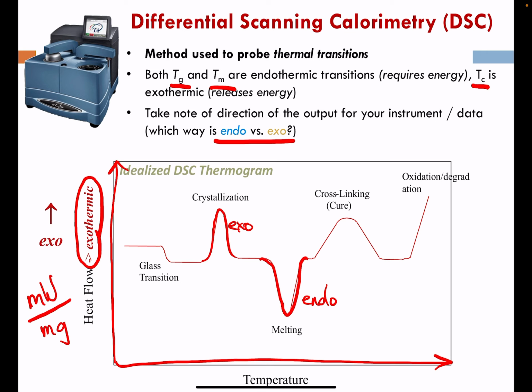Okay, so recalling that endothermic transitions are those that require energy. This is going to be useful for breaking intermolecular forces. Breaking bonds requires energy. And exothermic processes are the opposite. If we can bring molecules together and form stronger bonds, we might release energy. This should fit with the ideas of crystallization and melting, for example.